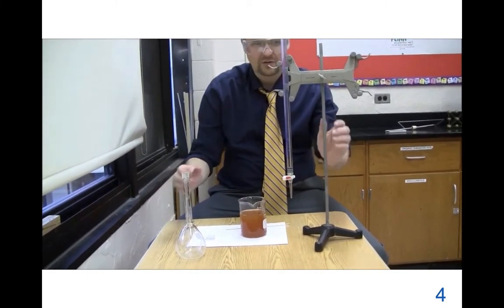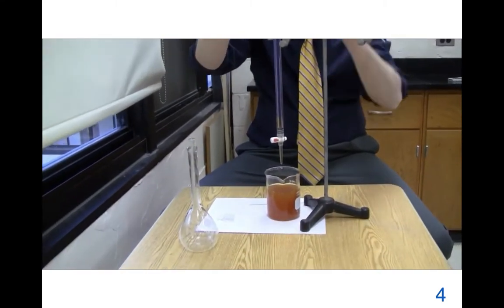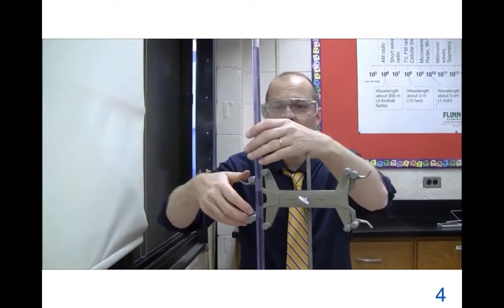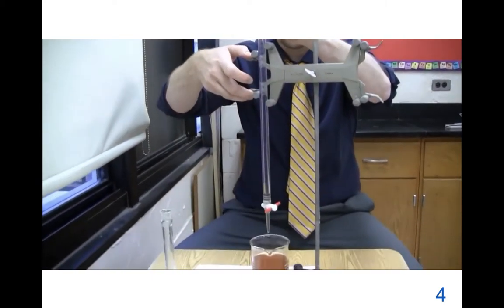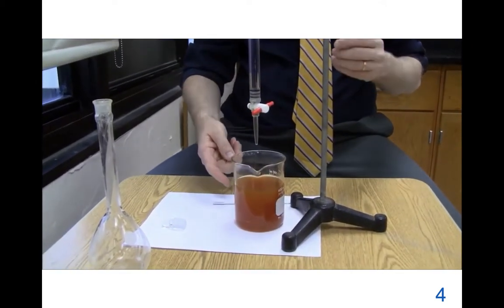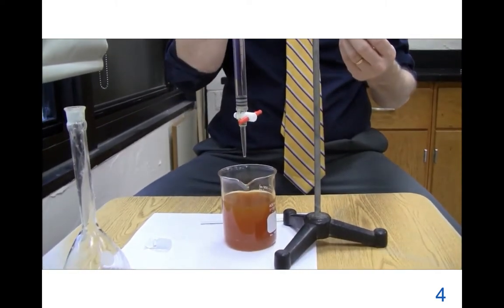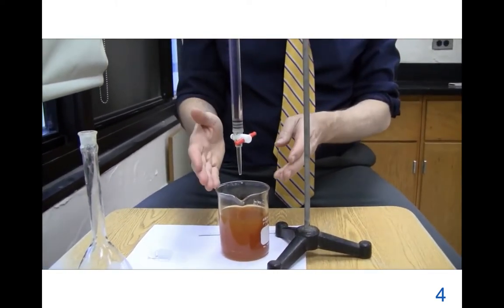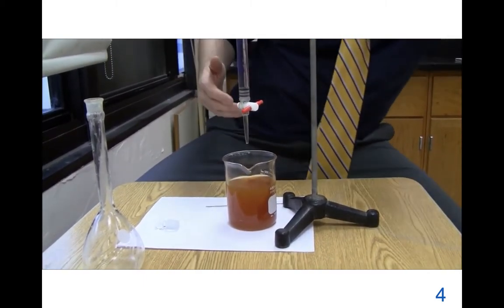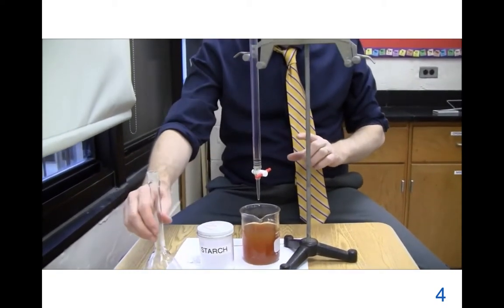Alright, now we're going to do a titration. This is sodium thiosulfate. Now, if I wasn't so brave, I'd split this sample in 2 to give me 2 tries at doing it. But let's see if I can titrate first time. Sodium thiosulfate is going to turn the brown I2 iodine molecules into colourless iodide ions. The transition from brown to not brown isn't as obvious as you'd like. So when I get close to the end, I'm going to add a little starch, and that's going to sharpen the end point.